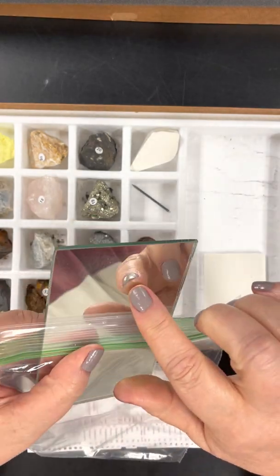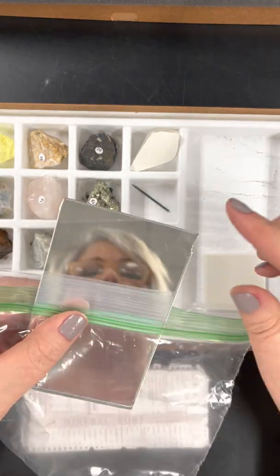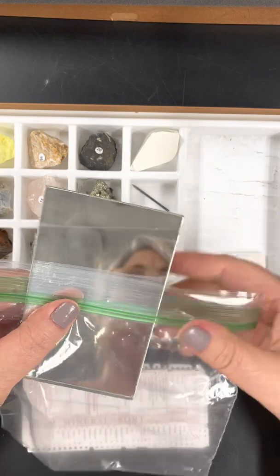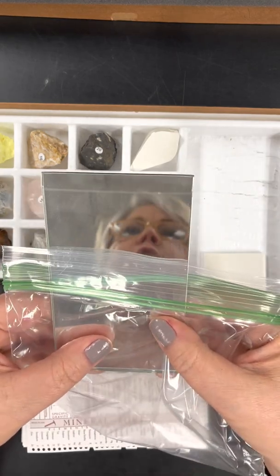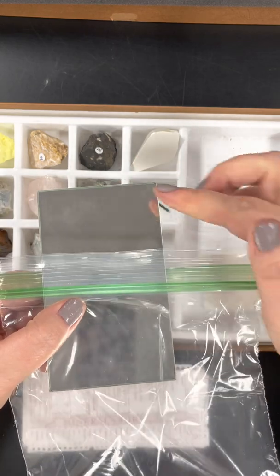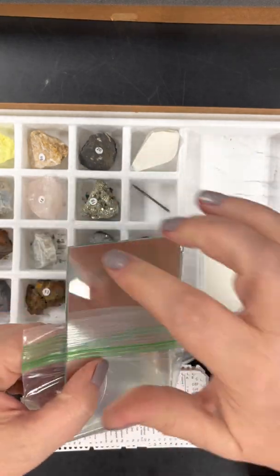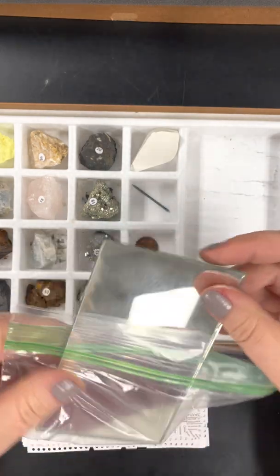And you need to use glass. And so we're just going to use this mirror. I think that's the best way. Please be careful of the corners. You can hang on to it using the bag. Oh, hey, there's me. You can hang on to it using the baggie, and I think it'll be a little bit safer for you. But just do be careful of the corners there, okay?